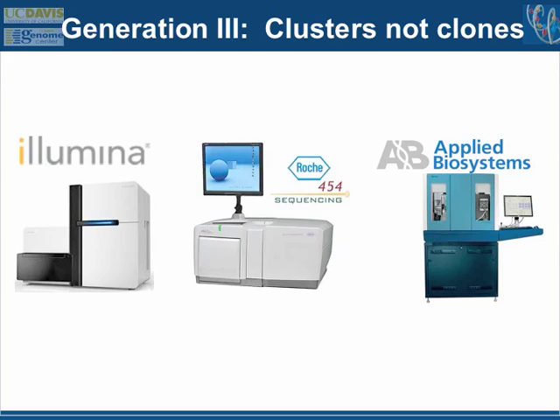You probably have a sequencing facility somewhere where they'll do a little bit of sequencing with one of these Sanger sequencing methods. At UC Davis, it costs between $3 and $5 total to get a clone sequenced. With Illumina sequencing, $5 buys you about 100,000 reads. So if you think about a way to make use of the Illumina sequencing technology, you're going to be much more cost effective in doing something with DNA sequencing.